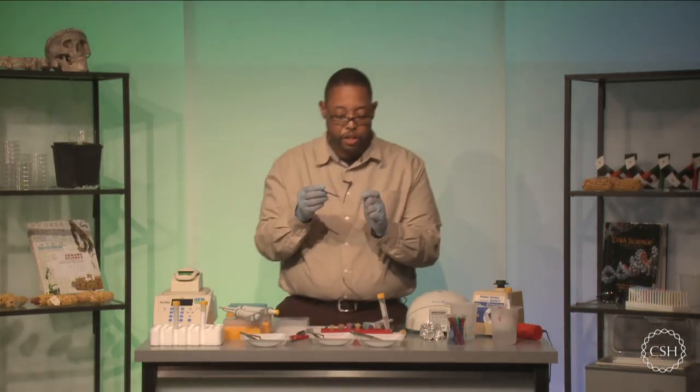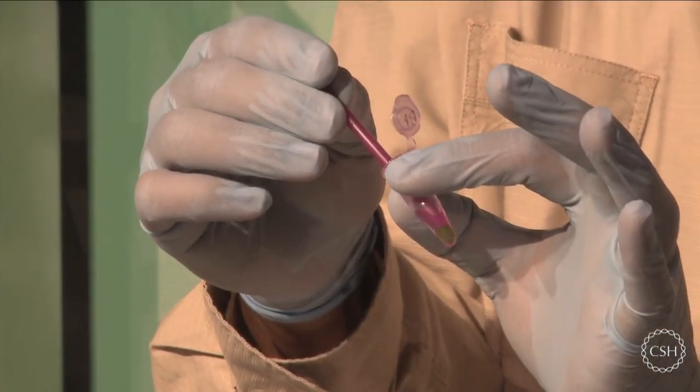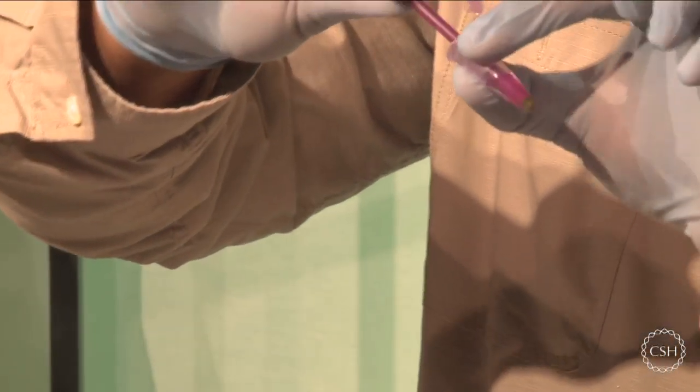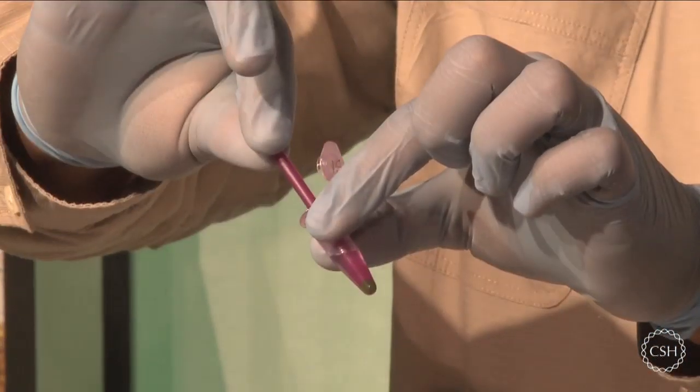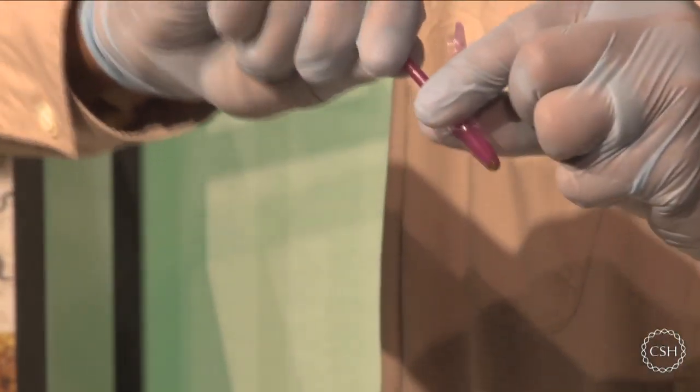So we're going to grind the tissue with our pestle here. So please make sure that the tissue is at the bottom of the test tube, and that if not, you push it down with your pestle. But what I like to do is trap the sample at the bottom of the test tube. And then what I'm going to do is press really hard and twist.